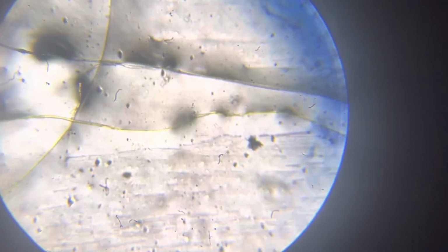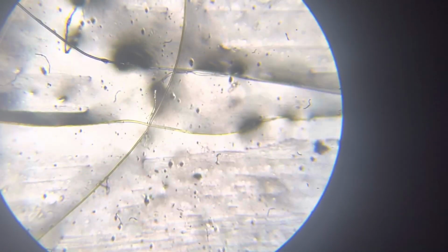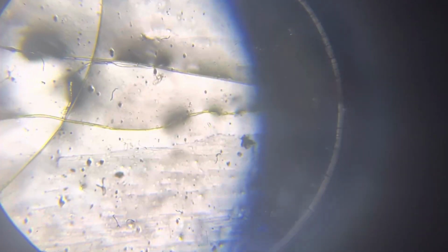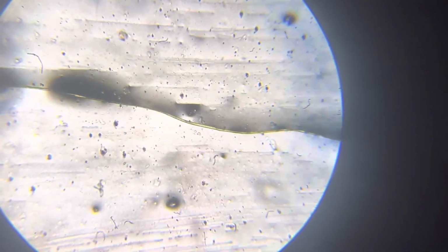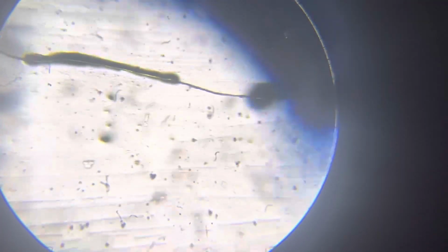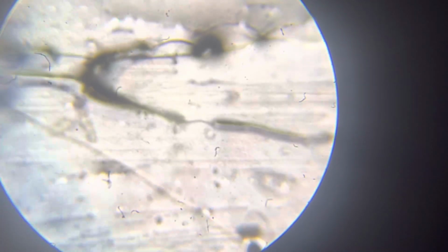This looks like a life form that is made like a thread with these flagella. It's called, I guess, certainly a life form, like sausages.